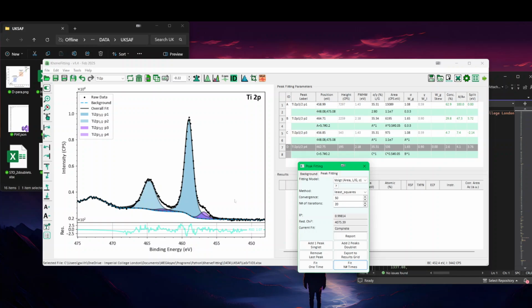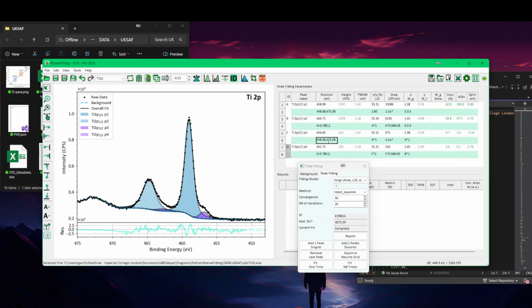But let's say now I'm happy with the fit, and I get a split between the model A and B, and the model C and D of minus 2.14. So if I type A in here, and maybe there is a slight mistake.